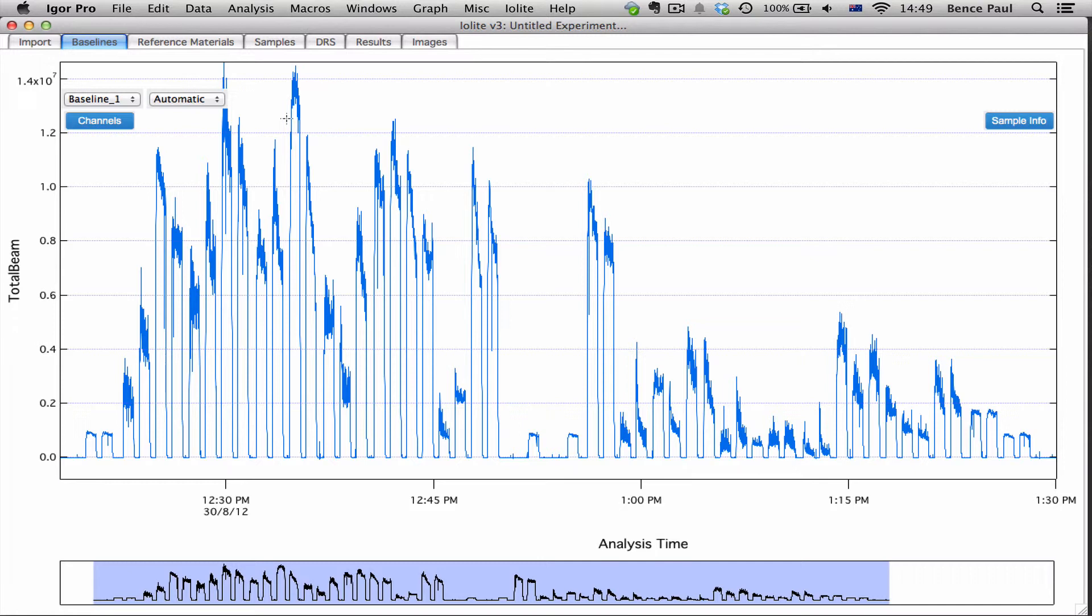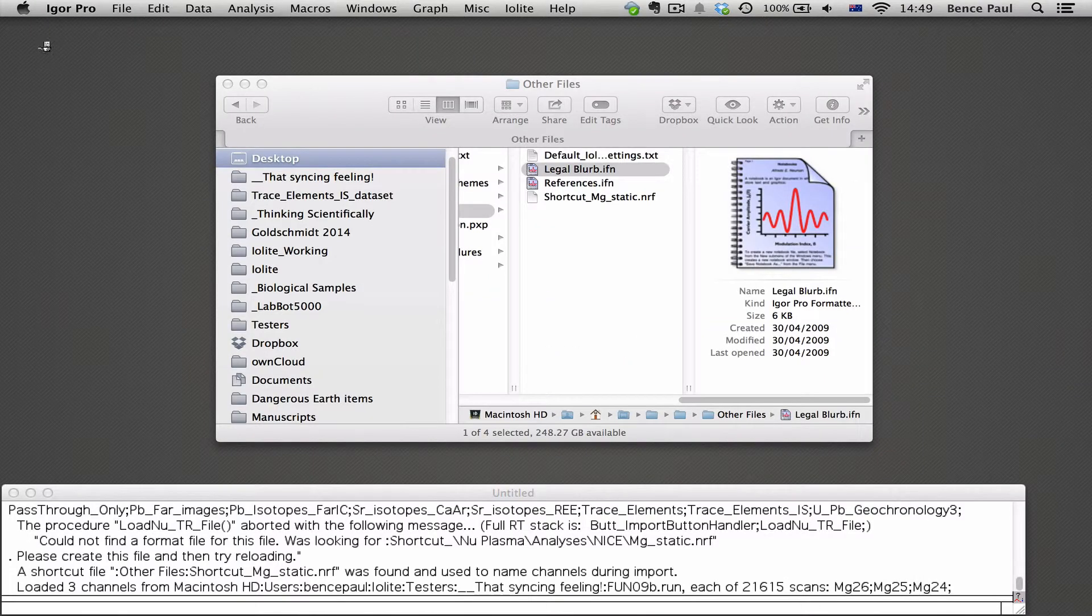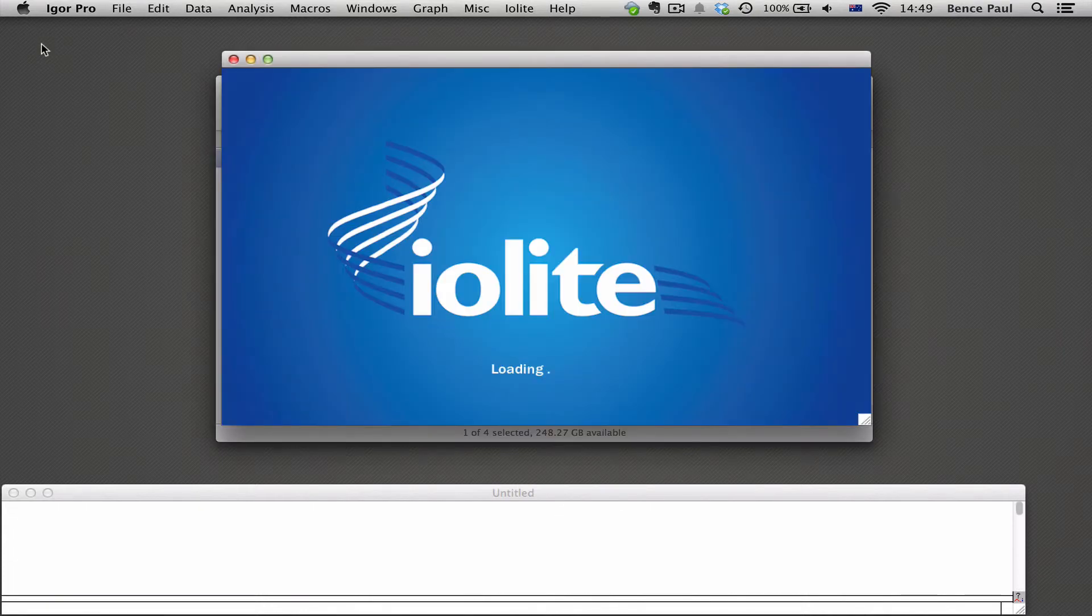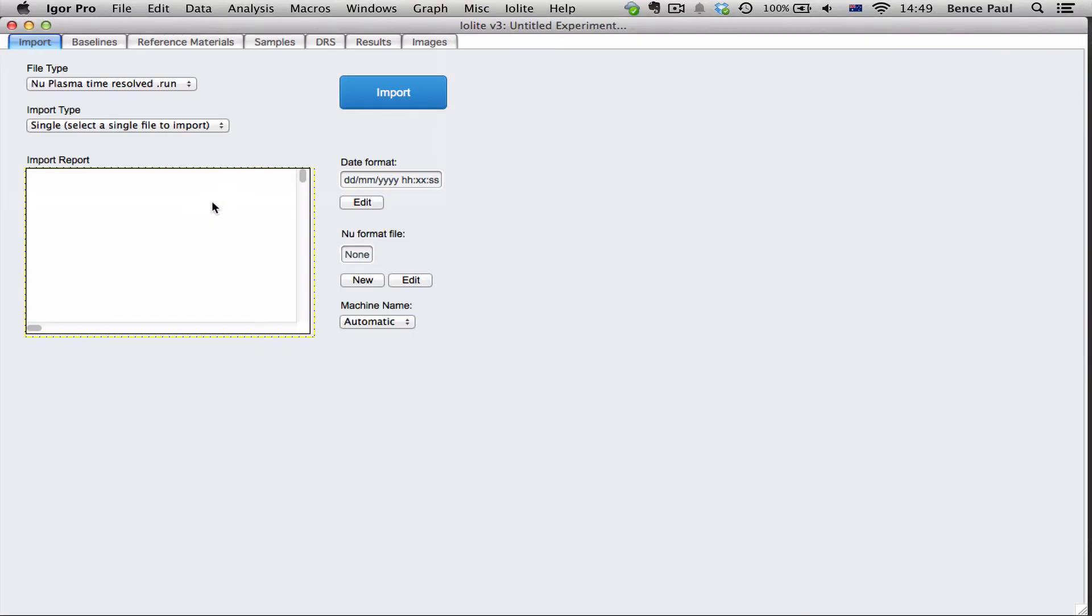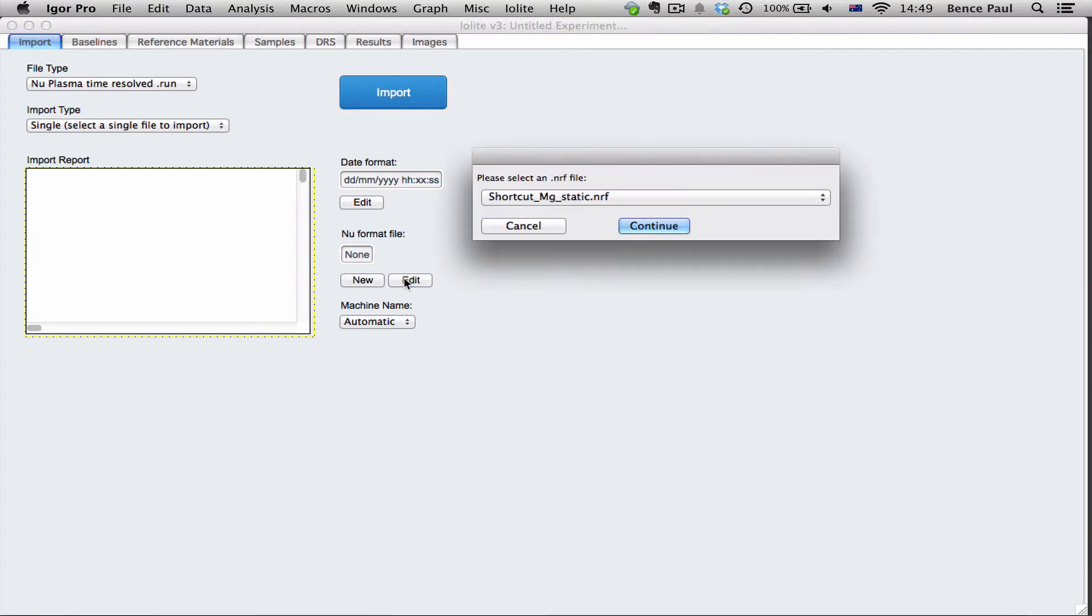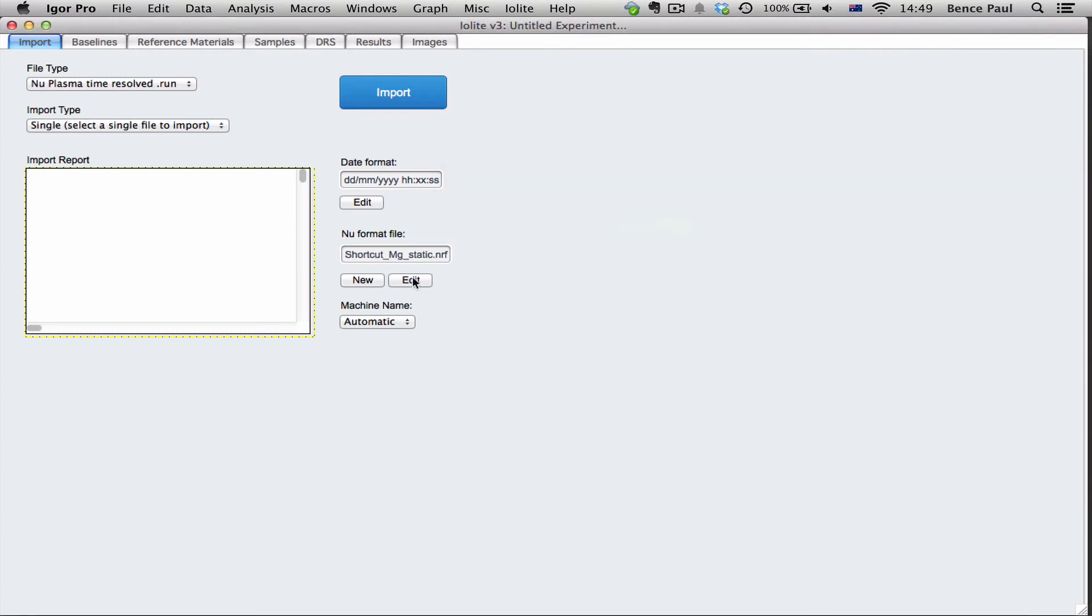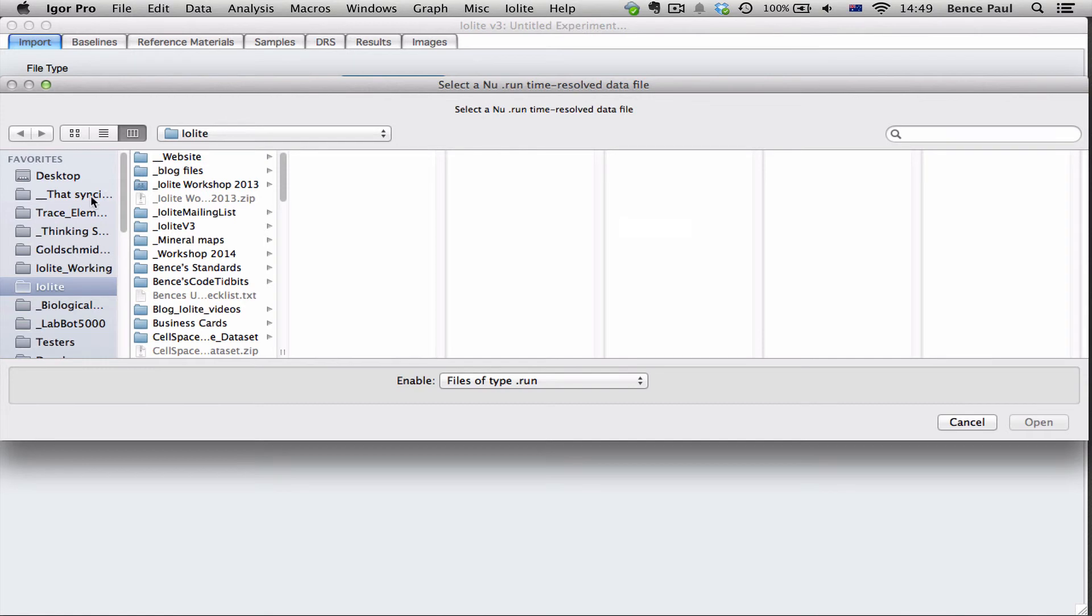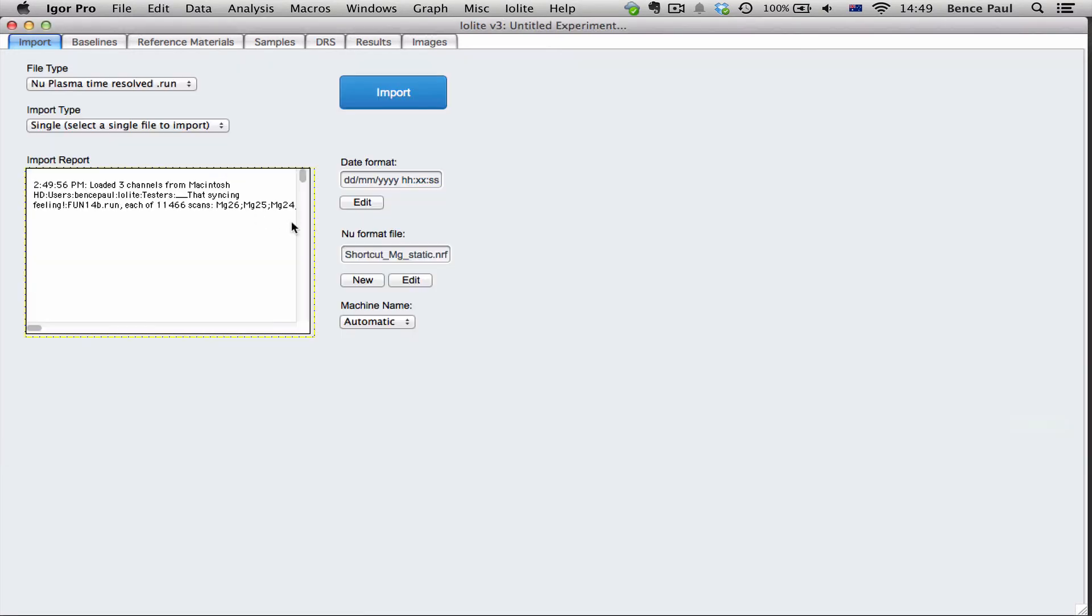So let's say we're in a new experiment and we want to open the same sort of .run file but from a different day. You can see here that it hasn't automatically selected one for us. So what we do is we click edit and we can choose from our list of format files that we've created in the past. We can select one of those, click continue and then we can just import our file straight away.